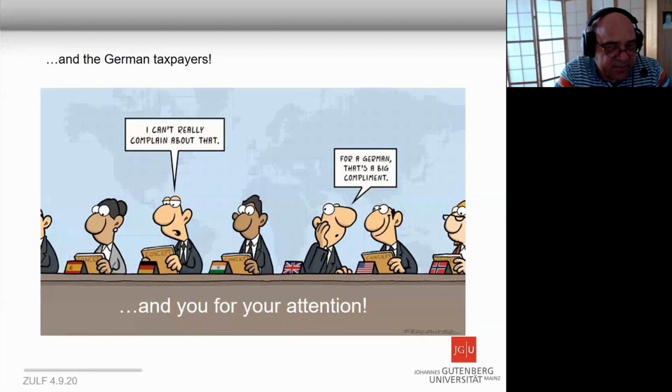Thank you. So let's move to the next question. Quentin asked, you have shown that you have managed to open the magnetic cylinder and do NMR with it. Have you already done the same with the magnetic sphere? Sphere? Yeah. No. This is something I suggested to Dimitris, but he had already different plans, and I never tried to build it. I just wanted to say that this is an interesting feature and nice instrument, and in principle it should work, but I haven't tried it. I must get much more bored than at the moment before I will try to do that. It's a nightmare.